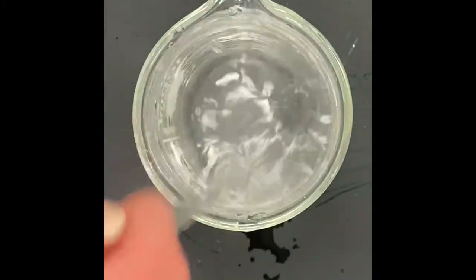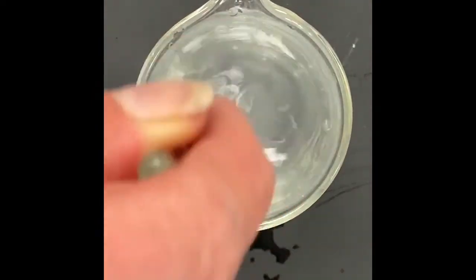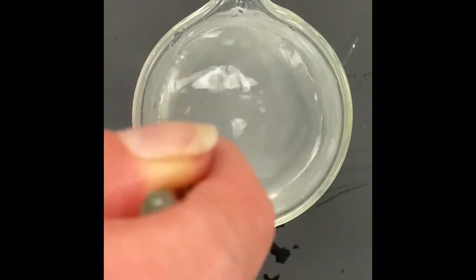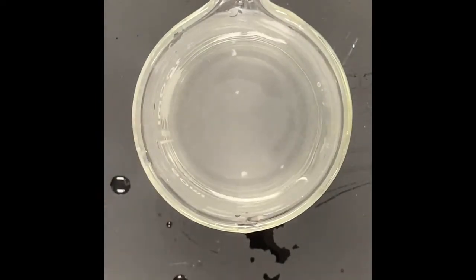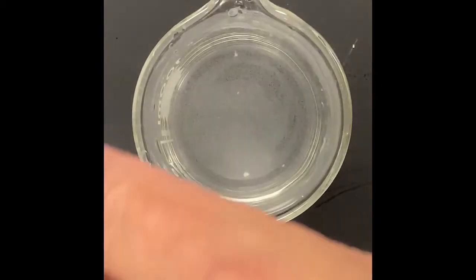All right, and stirring will speed up the process. We talked about that agitation a little bit. And we will come back and show you all these at the very end too, so you can see what happened. So again, make your observation. Again, it's just yes or no. Dissolved, did not dissolve. Next up, we will have citric acid.